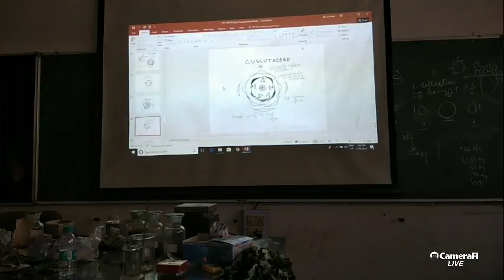We had made some of the slides, Farzana can show them. We made some slides of stomata to show you different types of stomata and the relationship with the epidermal cells. But I am sure all of you know how to take out the stomata and the epidermal cell.